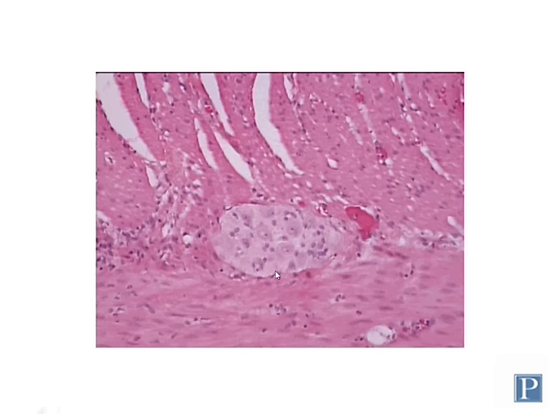So this particular parasympathetic ganglion right here is found in the wall of the gut, small intestines, one place you can find these. And in this particular case, it's wedged between two different layers of smooth muscle.